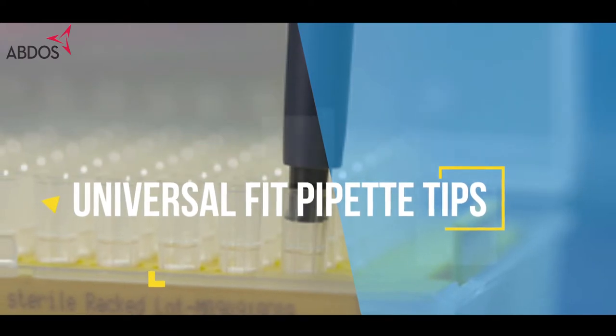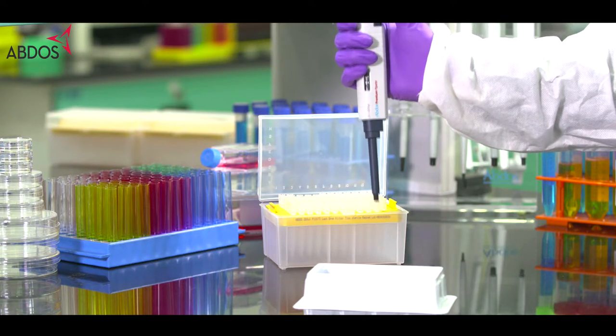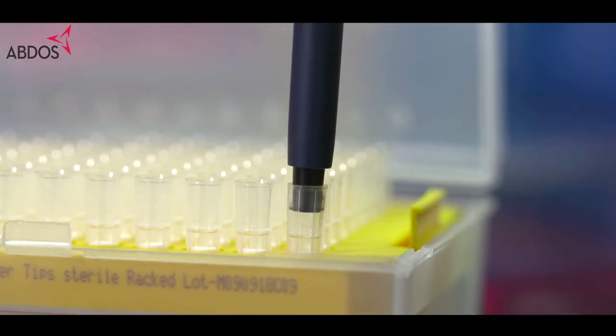The universal tip collar fits all popular pipettes. Thin wall technology ensures a perfect seal while reducing the loading and ejection forces.